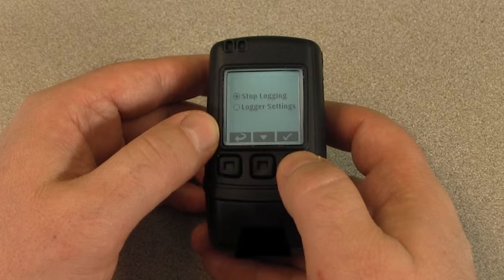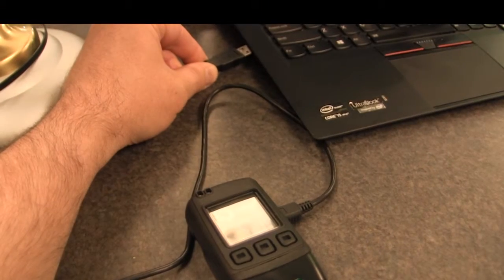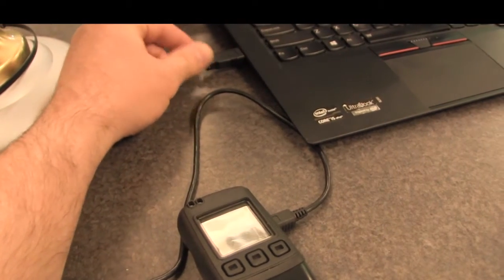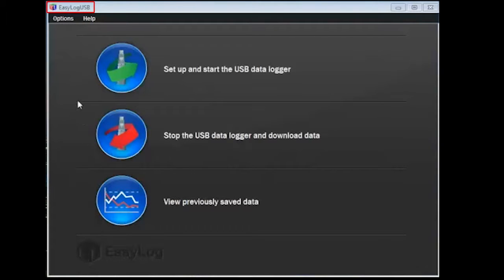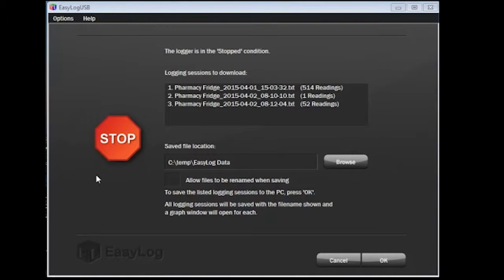Since you are removing the device from the controlled environment for a period of time, I recommend stopping the logging directly from the data logger once you have removed it from the controlled environment. Now take your data logger and connect it to the USB port on your computer using the included USB cable. Once connected, launch the Easy Log USB software and click on the option to Stop the USB Data Logger and Download Data. On the next screen, there is a message saying the logger is in the stop condition. You will see the logging sessions that can be downloaded — in this demo, there are about three of them.